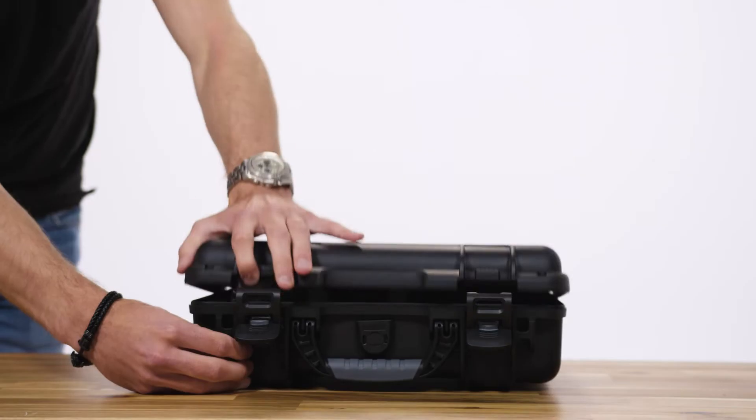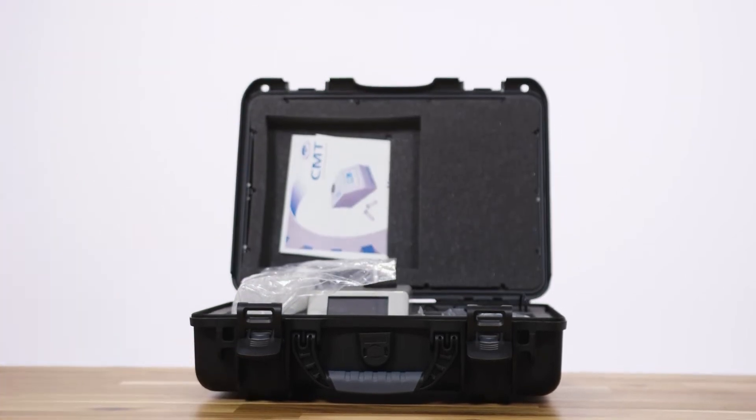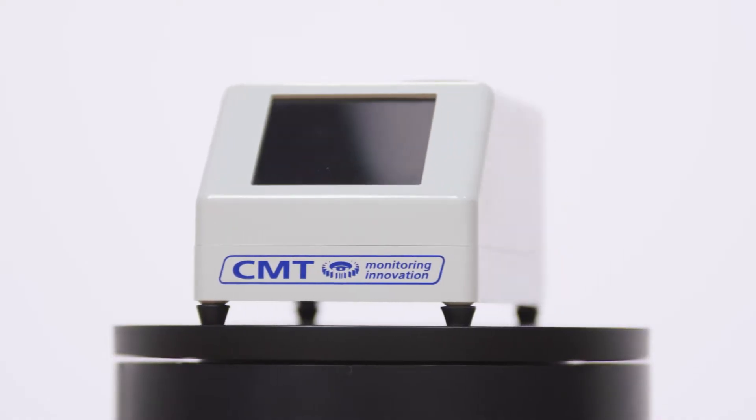Hi, my name is Jesse from GMS Instruments and today I will show you the new CMT Ferrous Wear Debris Meter, also known as an iron and oil tester. I will show you how the meter works and how to use it, so stay tuned.